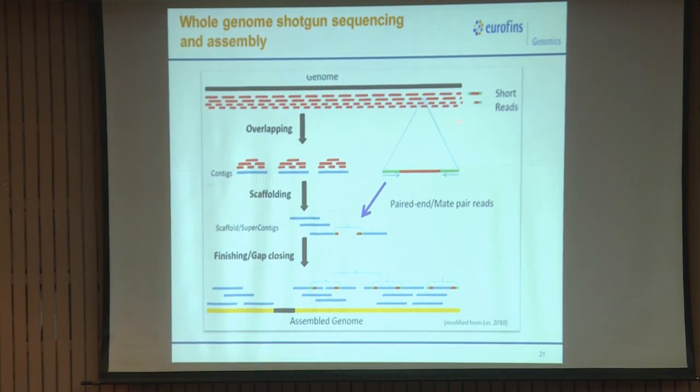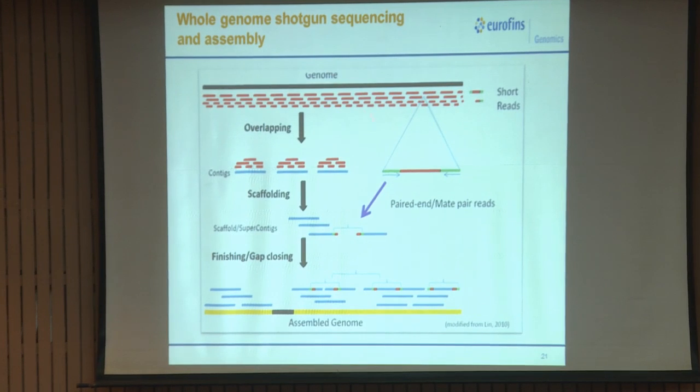We have a genome, we have small sequences of reads which have overlaps, as you can see, and an equivalent distance you will be able to see. They have equivalent distance because the assembler has been instructed to find overlaps within that particular distance itself. Only then can it become an accurate assembly, or else it will be a random one, and you will end up having some sequence which is jumbled up. Right. Then we have contigs followed by scaffolds.